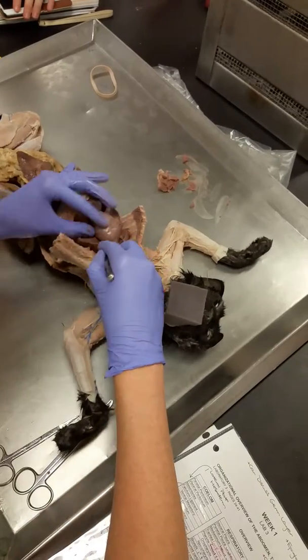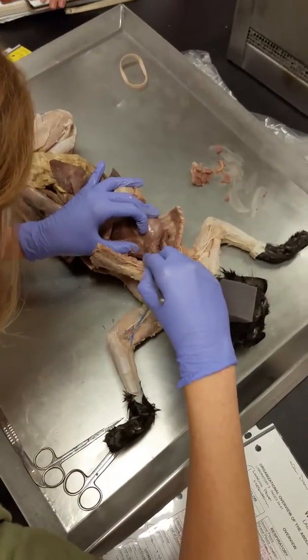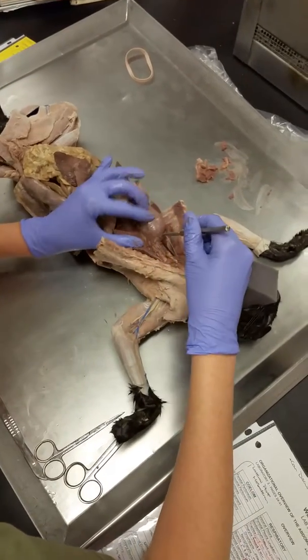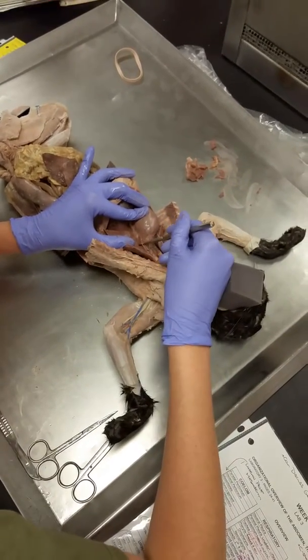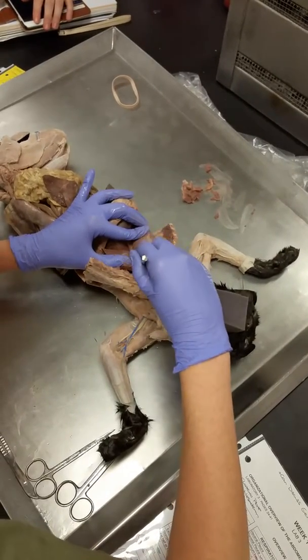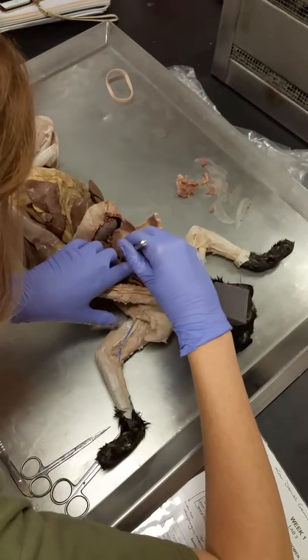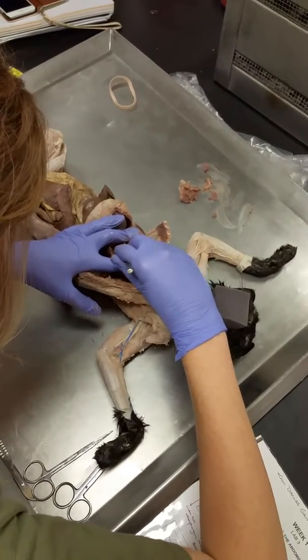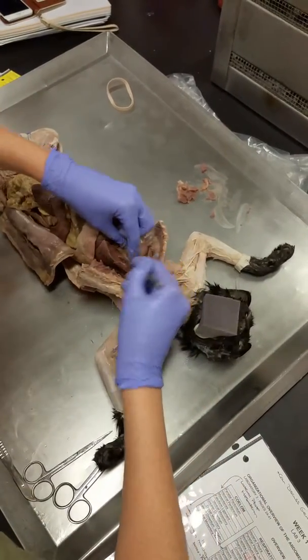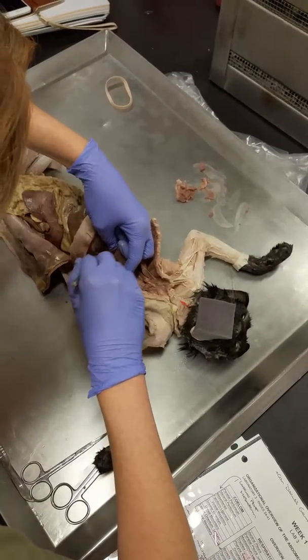On the other side here, here's my other one. You see this piece of dental floss right there? That's the other one. So the phrenic nerve is from your cervical vertebrae.